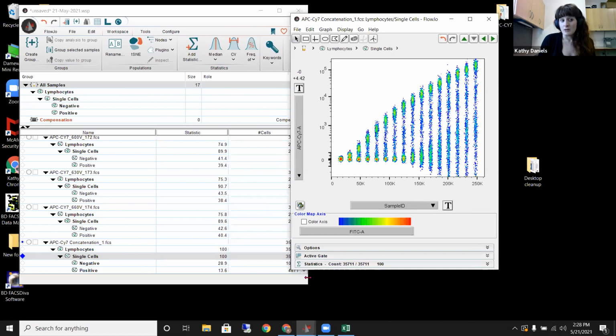I plan on doing it here at the Whitehead in the next couple of weeks, since they just came on board here. I advise everyone to do it for their experiments, but also understand that it can be very difficult to do. So I mentioned to people that you can do this and it's absolutely recommended. But if you can pull out populations and it's very clear, it might not be necessary.